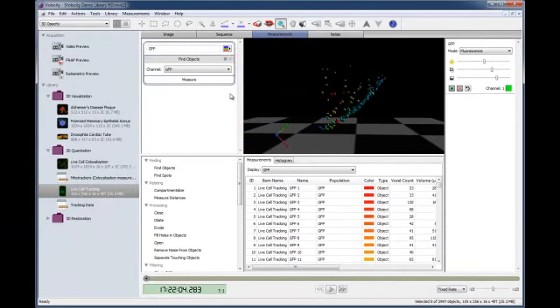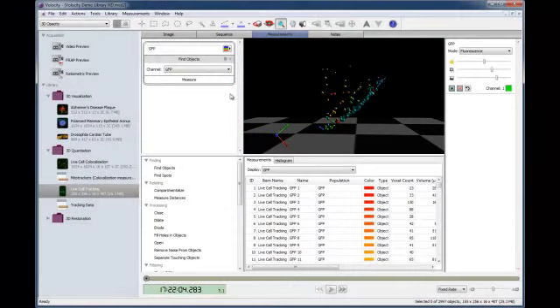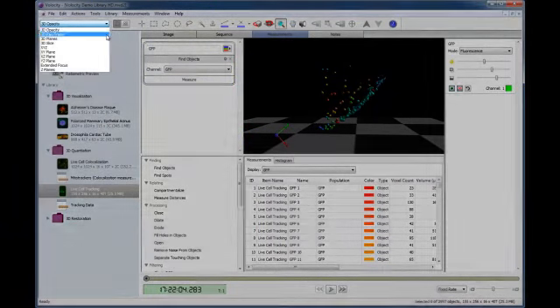Where intensities are found within range, a coloured overlay is applied. Groups of selected intensities form objects. View the image with object overlays in different ways by changing the mode of view in the top left.